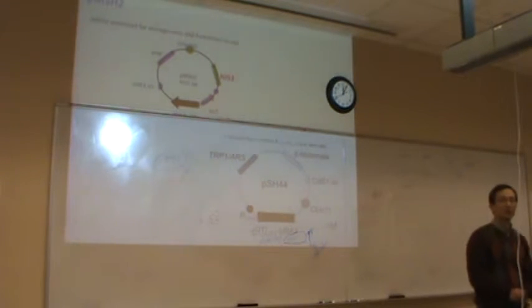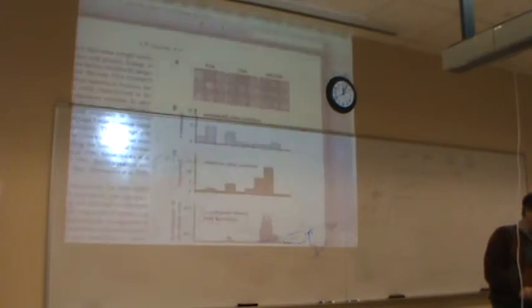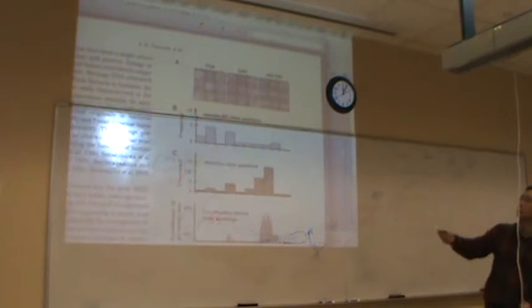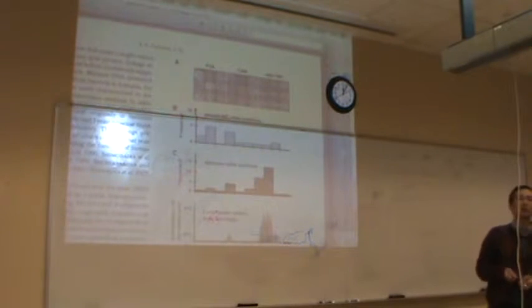That sounds like a mutation. AG371, I'm sorry. That's wrong, that's a strain number. What's the mutation? If you look at the paper, how is the mutation described? That's R542P, that's what the mutation is. So everybody's going to get the same, right? What's the mutation you are studying?